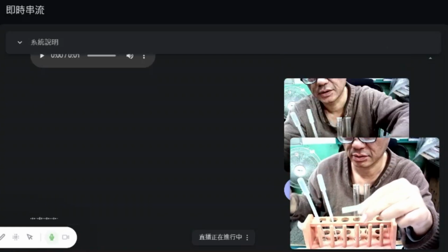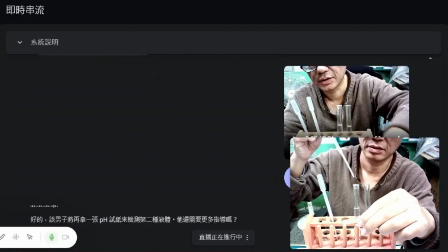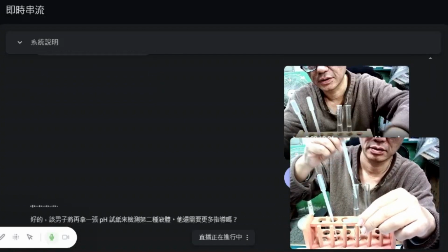Okay, the man will take another pH strip for the second liquid. Does he need any more guidance?